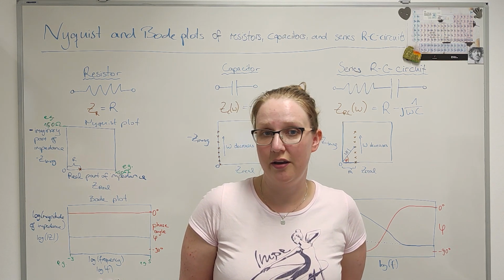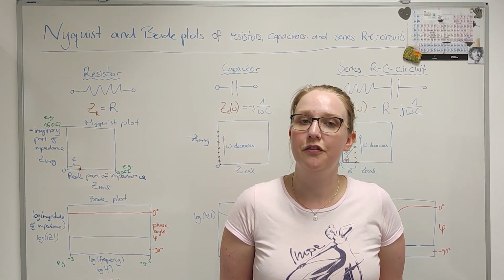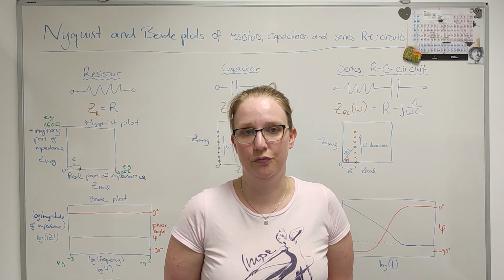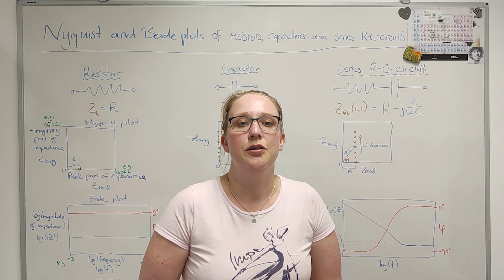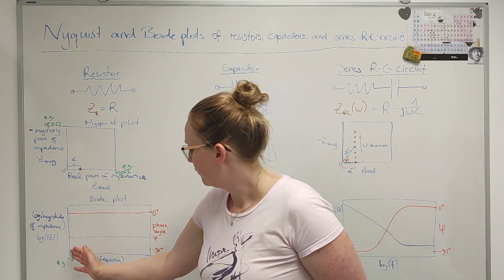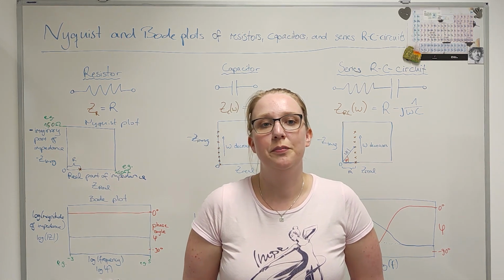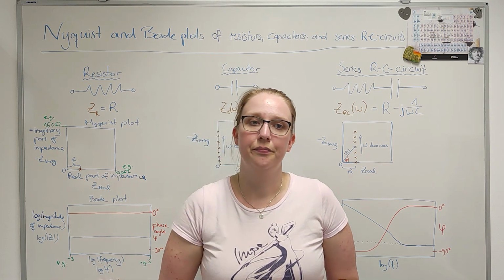As we have seen earlier, the current response to an alternating voltage is characterized by an amplitude and a phase shift. Because the impedance is the function relating current and voltage, it also contains two pieces of information, the relation between amplitudes and the phase shift. So, the Bode plot displays them on two separate y-axes, as they change with frequency. Usually we measure over several orders of magnitude of frequency, and thus use logarithmic scaling. The same applies to the axis of the absolute value of impedance.